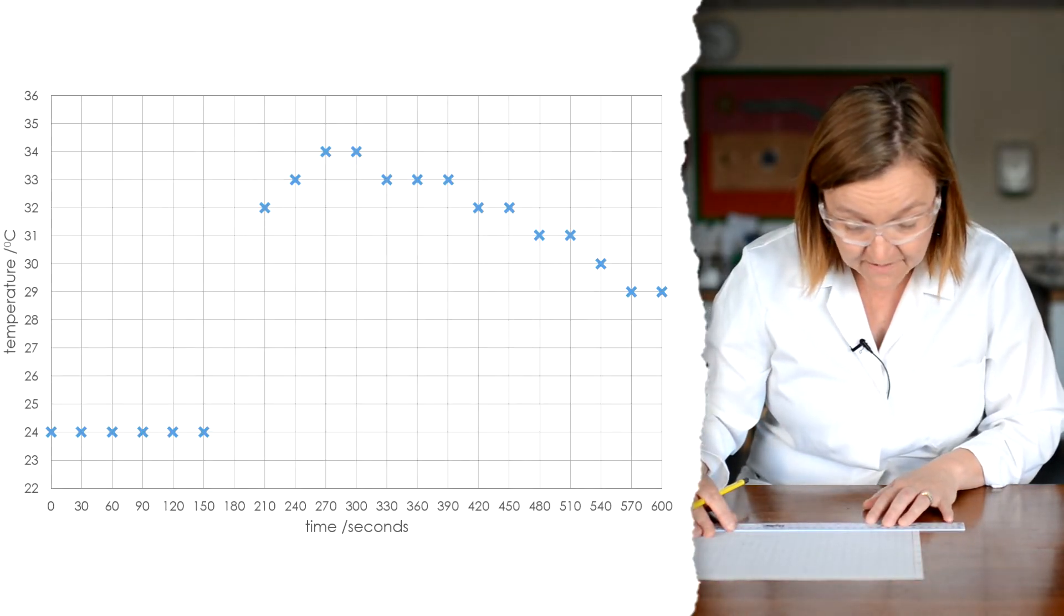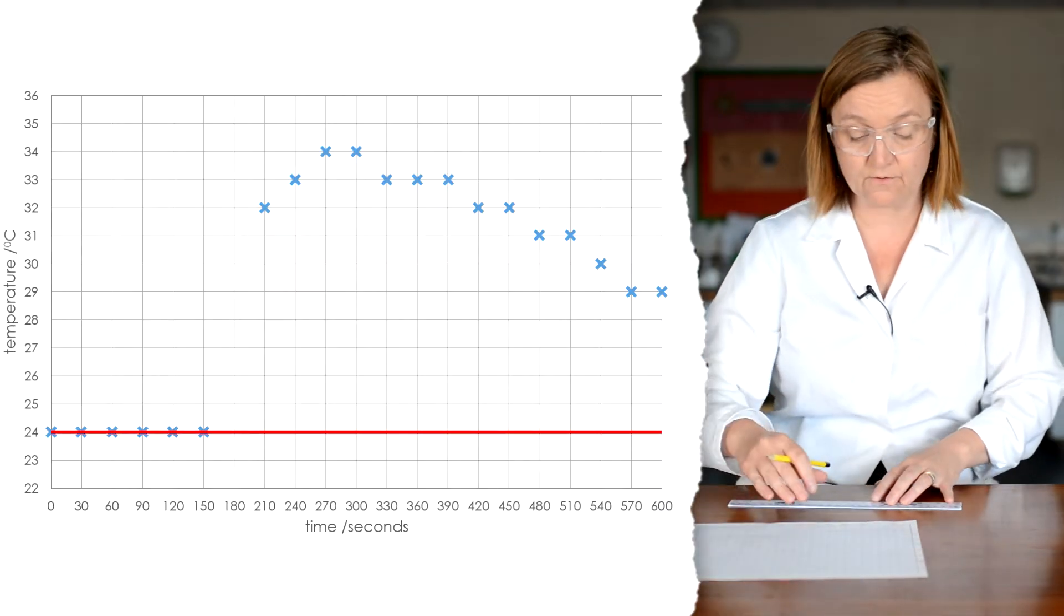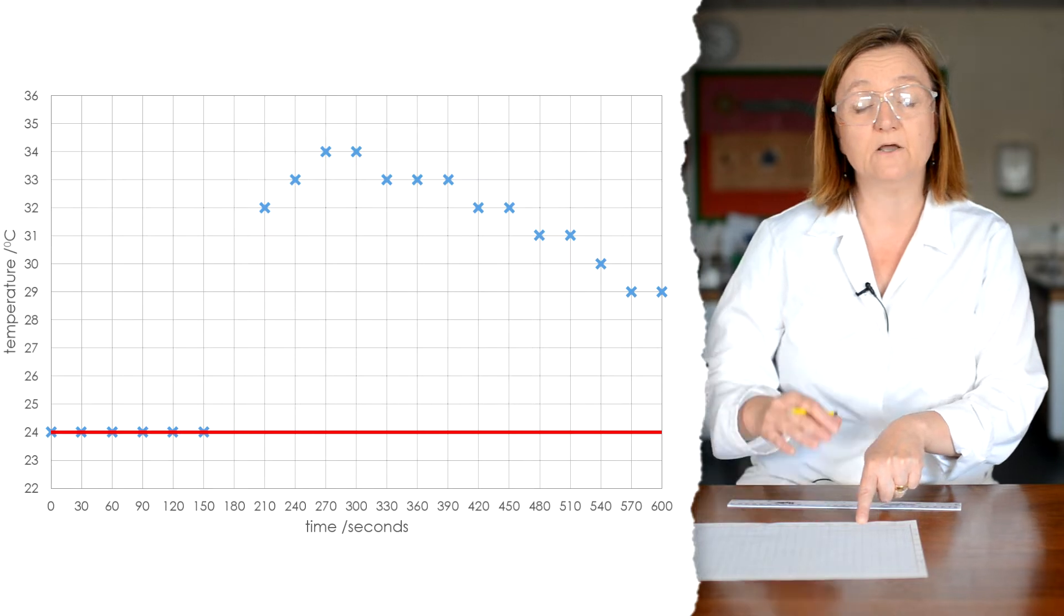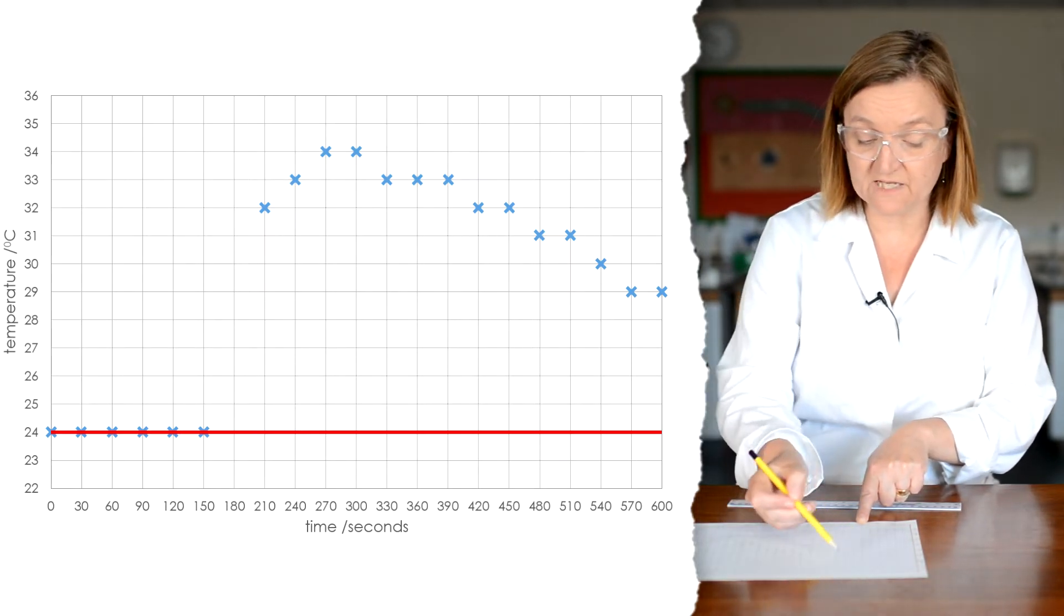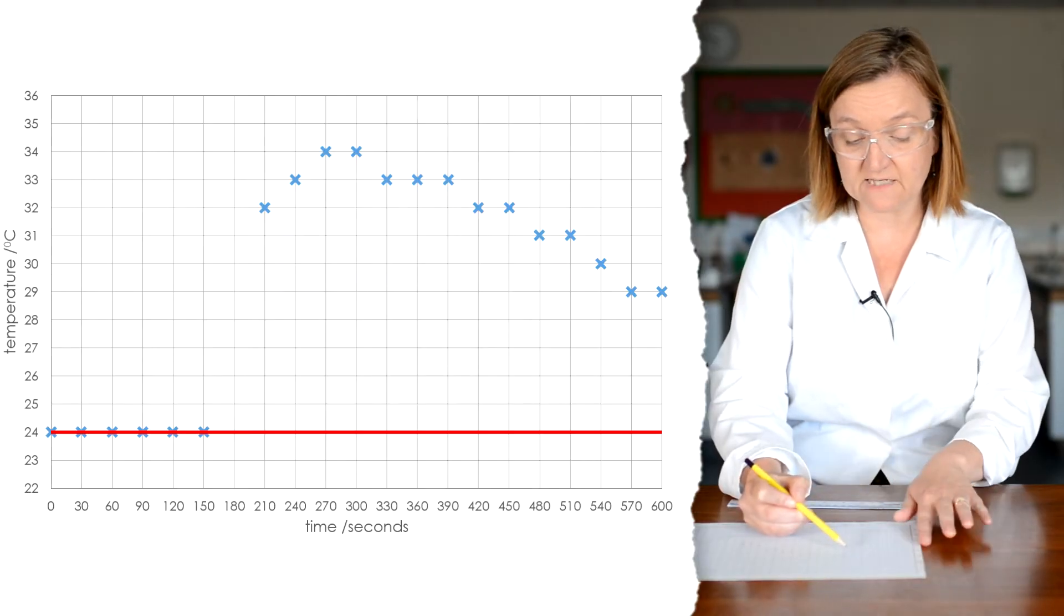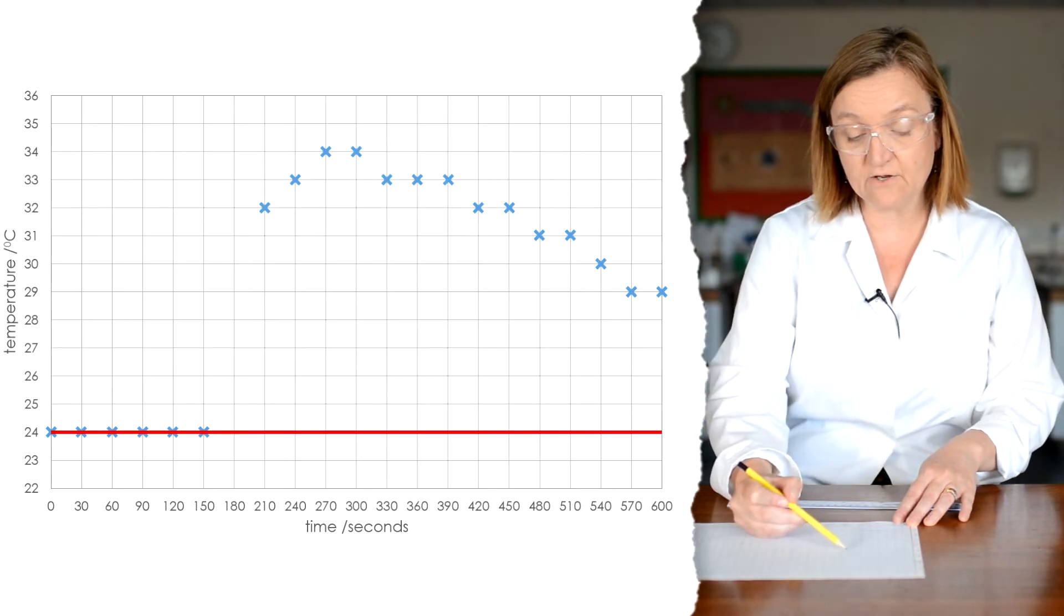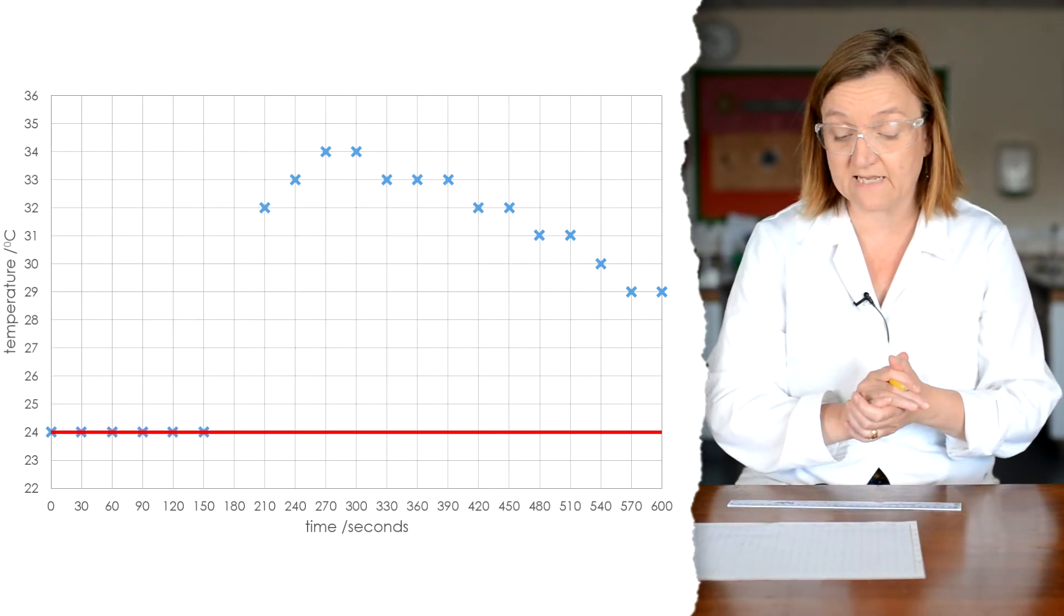And that was 24 degrees. So I'm just going to draw a straight line through those points there. So it goes past the three minute point, which is the point at which I added the acid. I've then got this part of the graph where you can see the temperature is increasing, and then it starts to decrease.